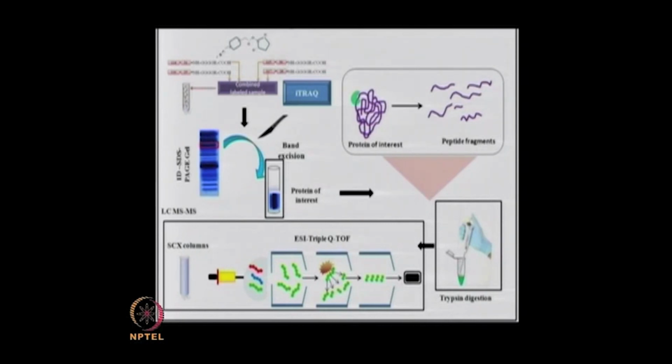One can use one dimensional electrophoresis or take the protein samples directly from the mass spectrometry based experiments, separate those on SDS-PAGE or 2D gel and then excise the band of interest or a spot of interest. The gel based techniques increase the dynamic range of analysis, since they involve sequential separation of proteins based on the molecular weight, lower to higher molecular weight.